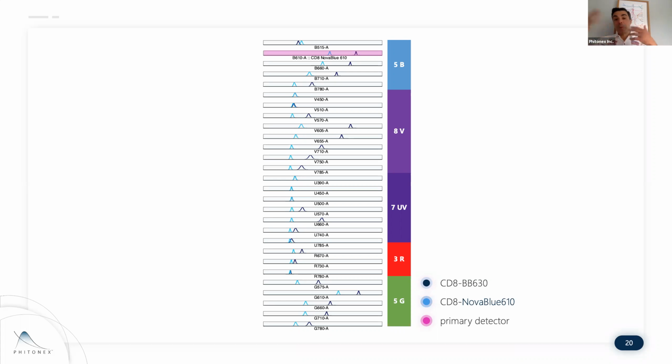And as we look forward, again, transparently, we see a lot of area in the violet where if you could do very, very good fluorophores there, you could do a lot more in the violet than we even are doing currently, right? I would argue that the same is true off the red. I mean, here you've got a FACSymphony instrument that's only got 3 detectors off of the red. That seems like a shame, honestly, right? I mean, we've already developed 4 labels off of the red, and we've gone from APC to APC-Cy5.5 replacements, and we can certainly build out into the farther red.